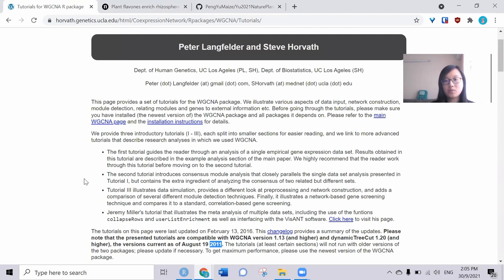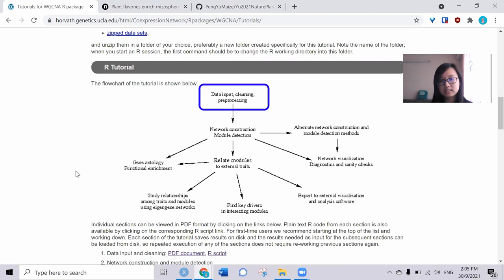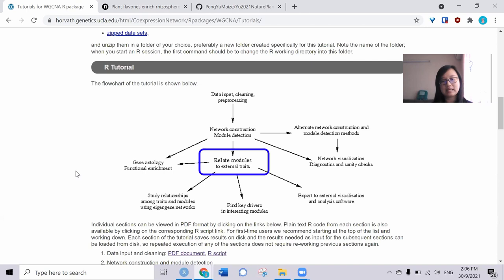Generally, we need three steps. First, arrange and input the data needed. Second, construct the network and assign the modules. Third, relate the module to external traits.